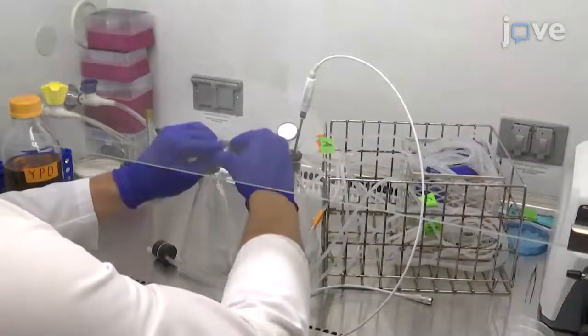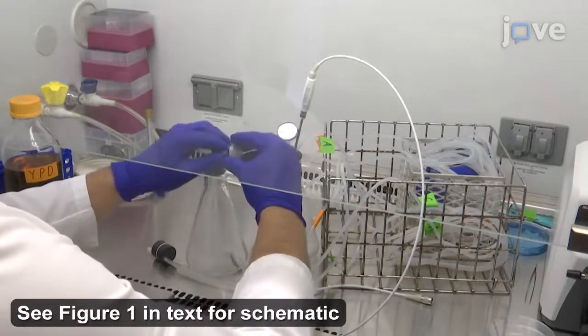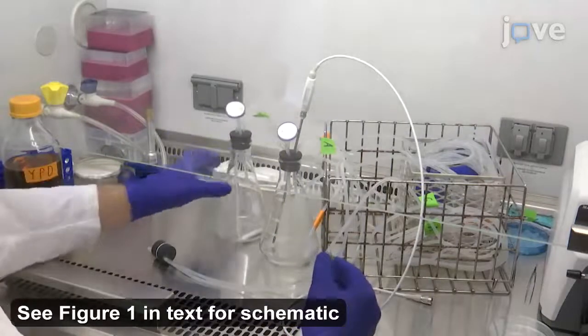Begin this experiment with assembly of the flow apparatus as described in the text protocol. The day of the experiment, attach the bubble trap, temperature probe, and all single-use components.